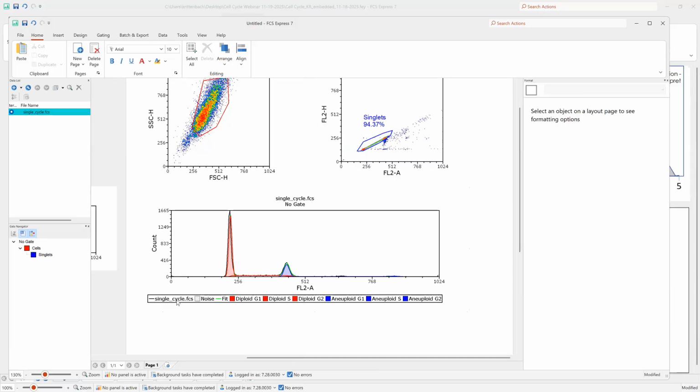So our black line here is the distribution of our data. This is the actual data in our data file, the actual outline of our data. Then if we do see any blue etching, that's going to be corresponding to detected noise, or noise that's being detected by the algorithm, noise, backgrounds. And then if we see a green line, that green line is the curve of best fit. That is the model fit, how the model is fitting our data.